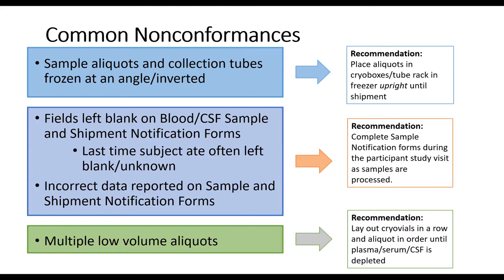We also ask that you please complete the sample forms during the participant visit and as samples are processed. I know there's a lot going on at that time, so it's definitely a busy moment, but if you leave it and say, oh, I'll just fill it out later when things settle down, then often fields can be missed or left blank unintentionally because that information wasn't collected.